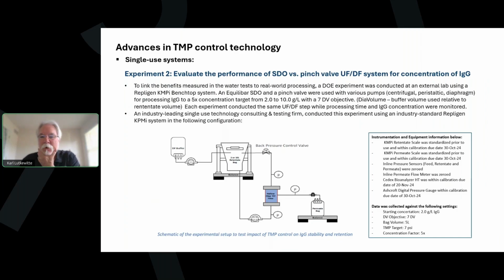And in this experiment, Ryan Hefner, who was our single-use technology officer at Equilibar, hired a company in Salem, New York, BioX, to do this test. And the test was commissioned to evaluate the performance of an SDO versus a pinch valve on a UF-DF system for concentration of IgG, immunoglobulin G, using different pumps: a Biofarm centrifugal pump, a peristaltic pump, and a quaternary diaphragm pump.